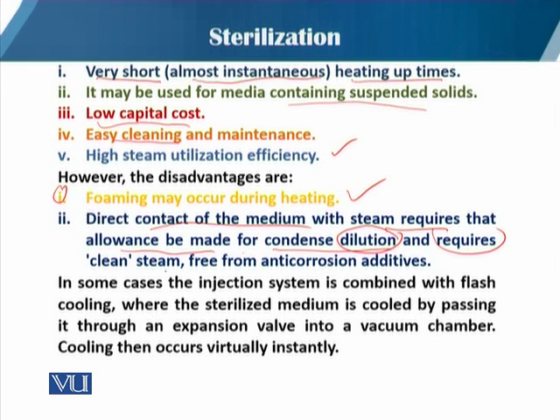It also requires clean steam, because sometimes particulates or heavy metals can be present in the steam, and it should be free from anti-corrosive additives.